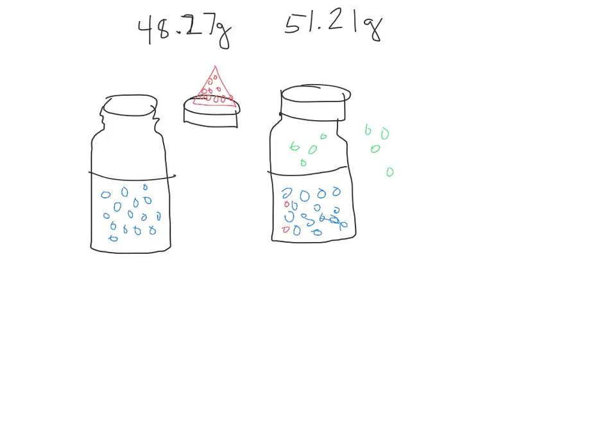If the lid was on loosely and you did everything as we had talked about, then some of the gas got out, some of the gas stayed in here. Oh, I didn't put any gas in the liquid. It's fine. The question is, how'd your mass go up by almost 3 grams? Well, I got an idea. Same thing that happened with the sugar. I'm pretty sure it happened a couple times here.